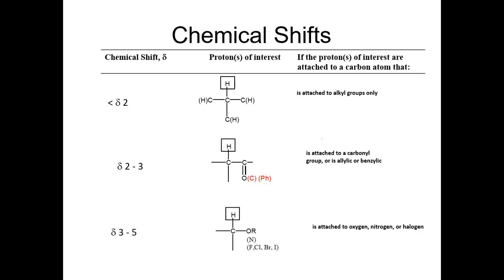Then if you looked at the infrared, you could tell, well, there's an absorbance or signal at 1615 reciprocal centimeters. So that wouldn't necessarily be a carbonyl, but it could be a double bond. So there's a way to interpret all this together in totality to determine the structure.